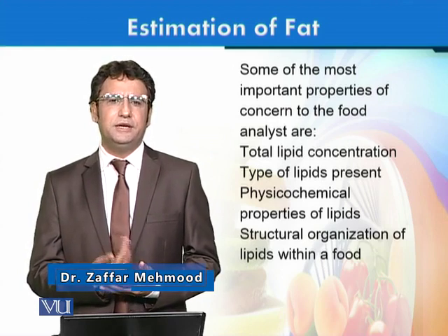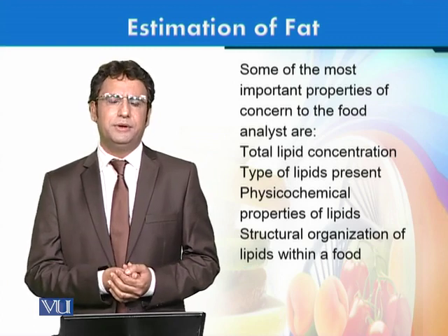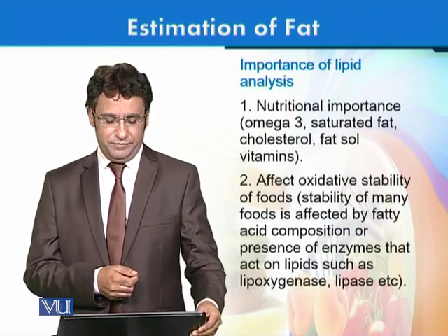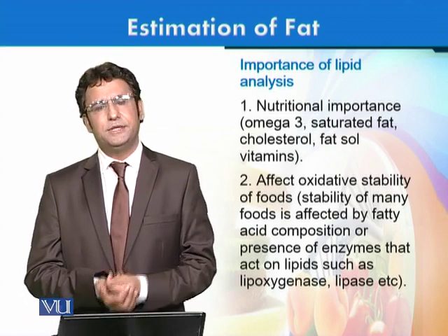So these three kinds of analysis are normally performed: amount of lipid present in the food, the type of lipid in the food, and the physical properties of the lipid in the food. And why is this analysis important?